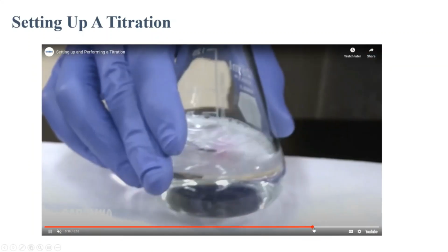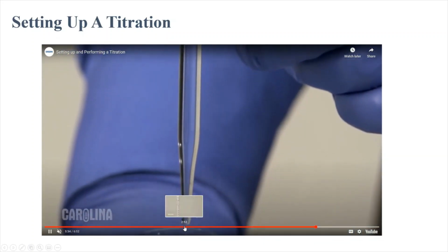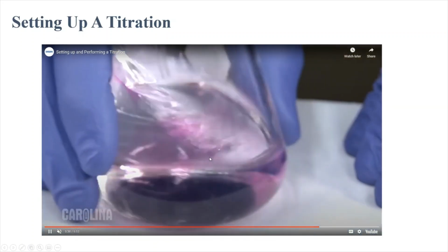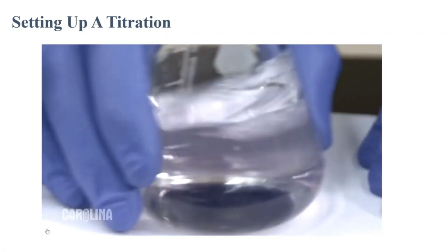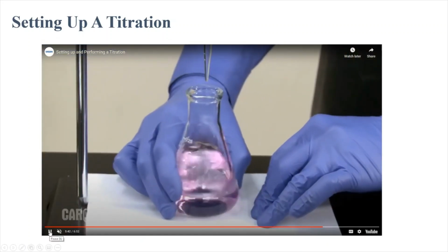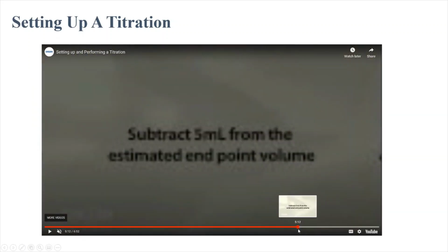Okay, so I zipped ahead a little bit. You can see he starts adding. And now, as he adds it dropwise, you see how long it takes for that pink to go away? That's an indication that we're getting very close to the endpoint. And then what he's looking for, and he shows it here, is you want to have a solution.